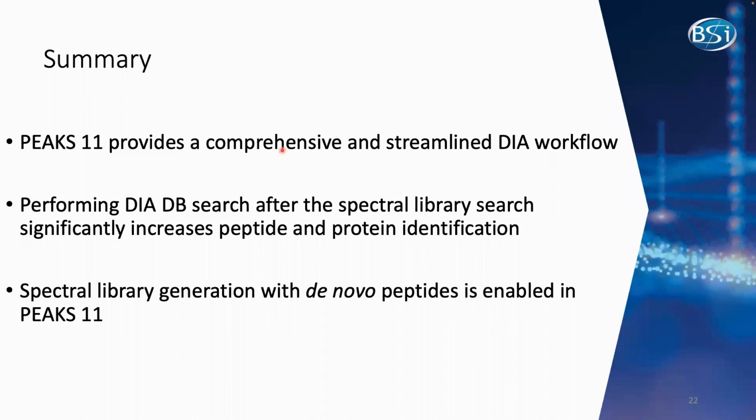I hope my presentation so far demonstrates PEAKS 11 provides a comprehensive and streamlined DIA workflow. Peptide identification and protein identification are increased by performing DIA database search after the spectral library search. And in PEAKS 11, de novo peptides can be exported for spectral library generation.